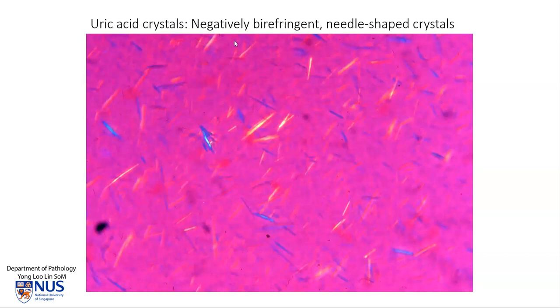In this instance, they are negatively birefringent. You can see that they are yellow in this direction, and roughly at right angles to this, they are blue. So the combination of the needle shape and the negative birefringence is characteristic for uric acid crystals, as seen in the fresh specimen under polarized light microscopy.